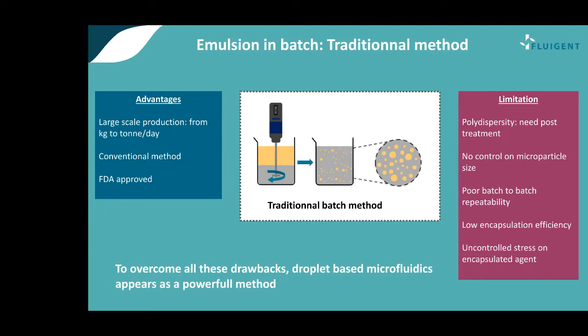And also it is FDA approved. So according to the Food and Drug Administration, this technology is approved. However, we have seen that this technology comes with many limitations, such as a big polydispersity. That means that we have a big dispersion in terms of microparticle droplet size. And in this application, in drug delivery, we want to target one specific size because the size of the microparticle is directly related to the delivery of the drug, the release of the drug.